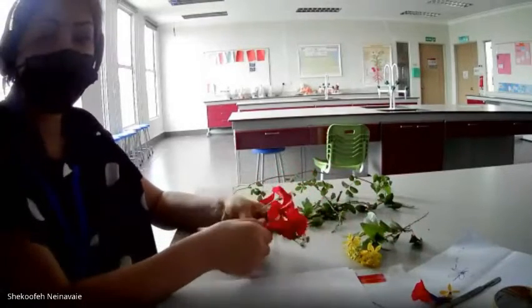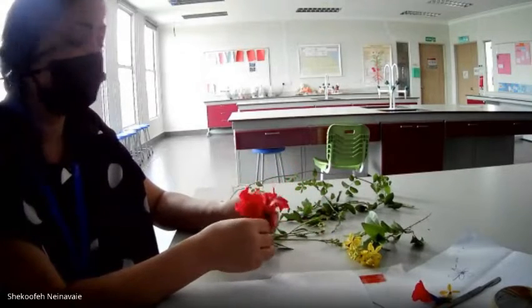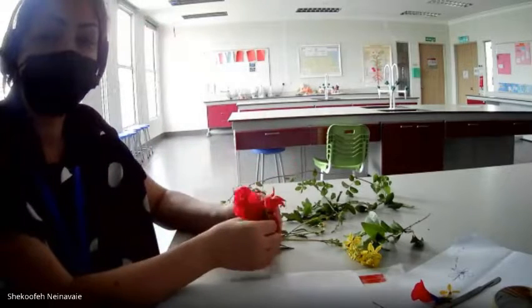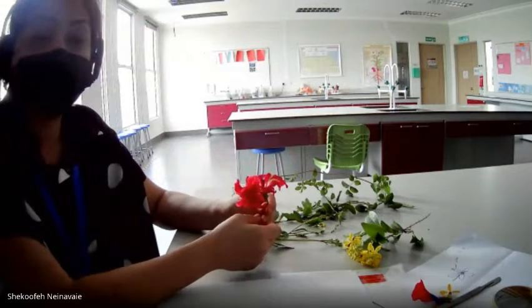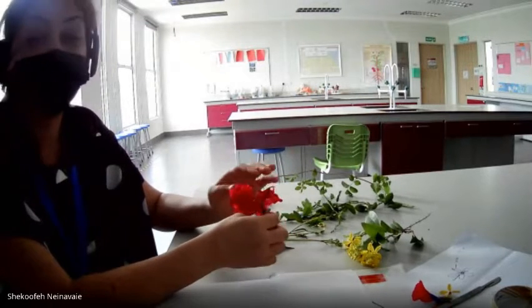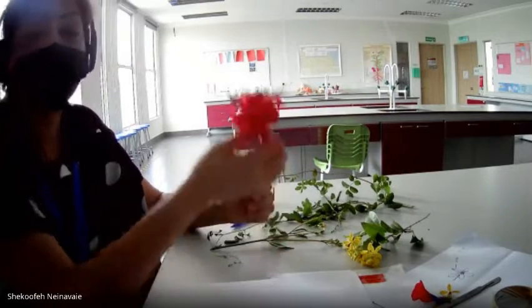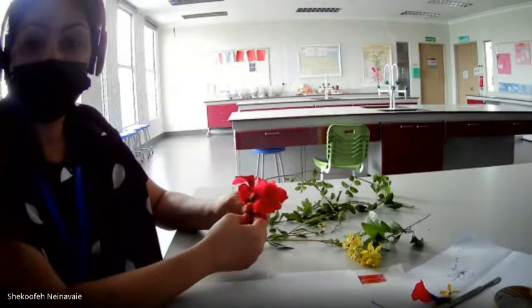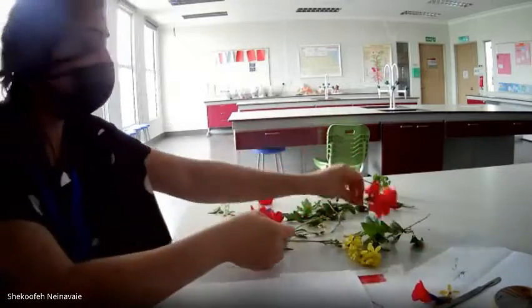Hello, students. I want to teach you about reproduction in plants, and as reproduction happens in the flower of the plant, I want to dissect these flowers and teach you how to identify the different parts of these flowers, the male and the female. You know that some flowers have male and female on one stalk, and some are on different individual plants. For example, I have different types of flowers here.